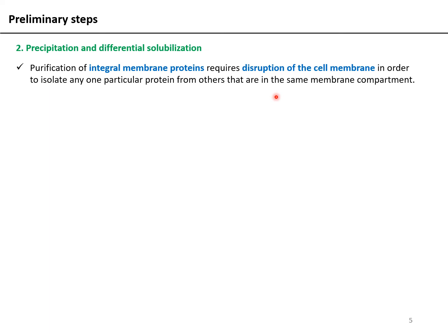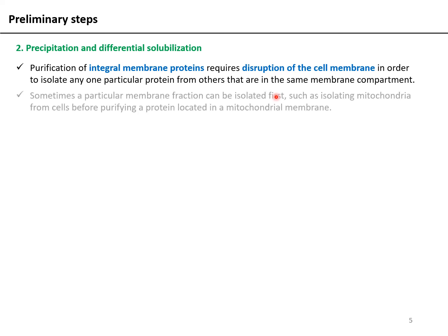In the previous lecture, if you have gone through it, we discussed how we can use detergents to lyse the cells and solubilize the membranes. But your detergent of choice, in case you want to isolate a membrane protein, has to be a mild one. You cannot select any harsh detergent which will completely denature your protein embedded in the membrane. So you need to select an ideal detergent for this purpose.